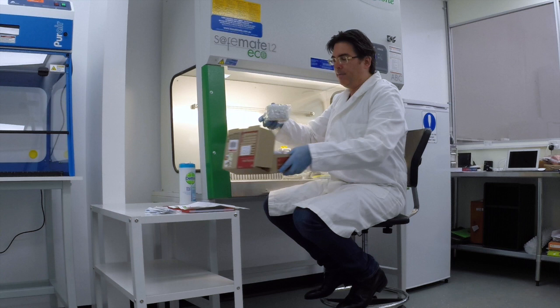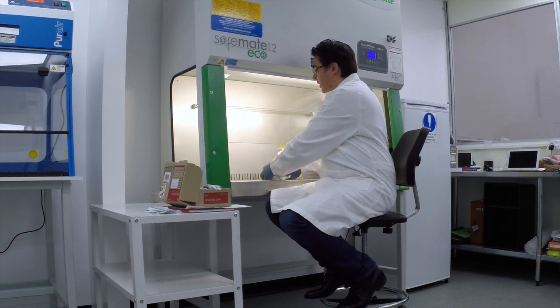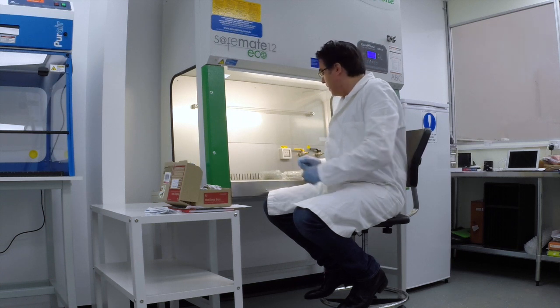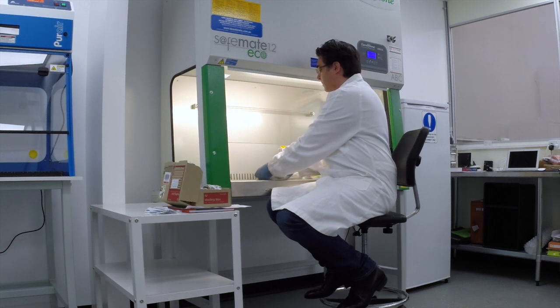I have the set of petri plates which we then put into the biological safety cabinet which protects me from any pathogenic bacteria, yeast and fungi. So obviously we will then inspect these and write you a report.